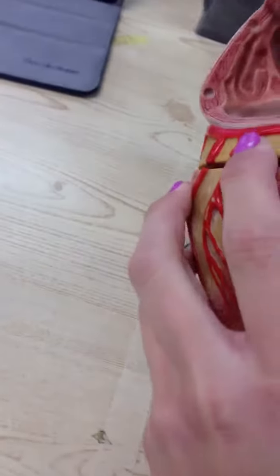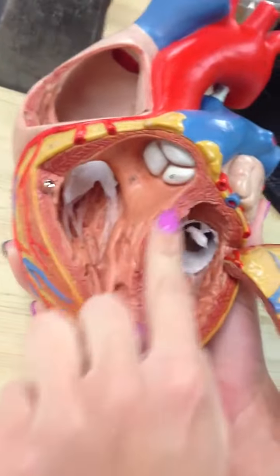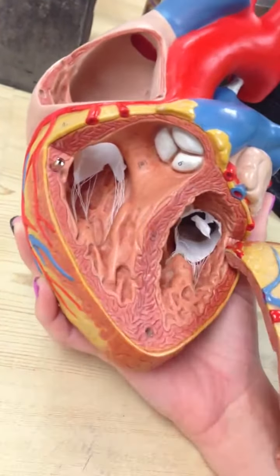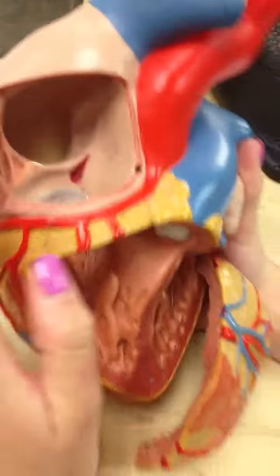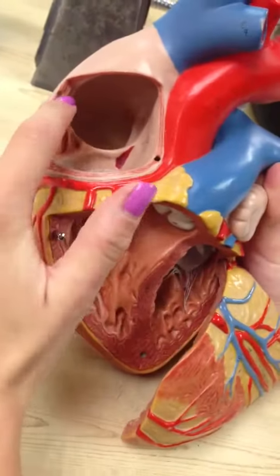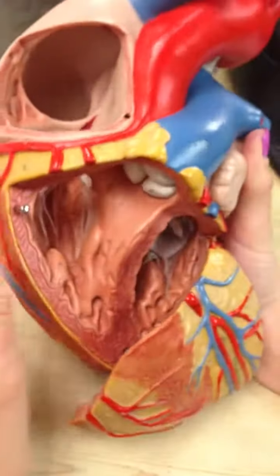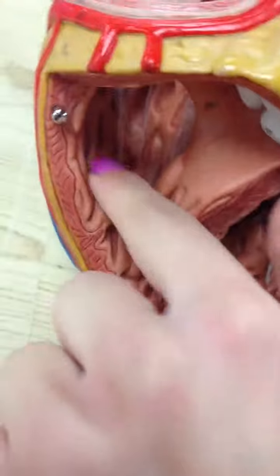And then when you open the heart up, you have your interventricular septum that separates the two ventricles. Up at the top over here, you have your pectinate muscles. The ridges right here are your pectinate muscles, which is by your right atrium up here. Your trabeculae carneae is going to be in your ventricles, which is the ridges in the ventricles.